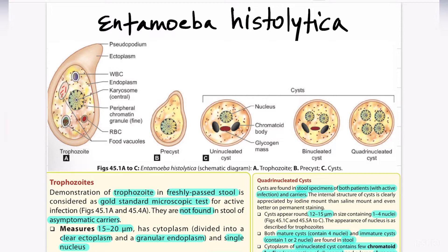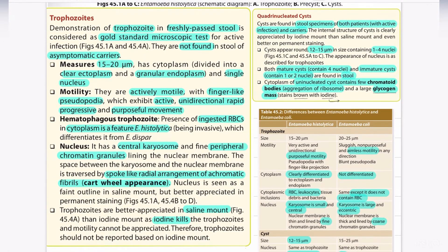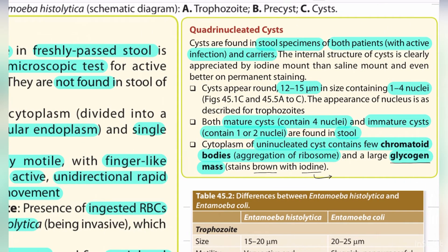The pre-cyst consists of a single nucleus and chromatin granules. The cyst is present in three forms: uninucleated cyst, binucleated cyst, and quadrinucleated cyst. Uninucleated cyst consists of a single nucleus with chromatoid body and glycogen mass. Binucleated cyst consists of two nuclei, whereas quadrinucleated cyst consists of four nuclei. Trophozoites are present in the stool of actively infected persons and are not found in stools of asymptomatic carriers, whereas quadrinucleated cysts are present in stool specimens of both patients with active infection and carriers. Chromatoid bodies are aggregations of ribosomes, and glycogen mass is also present.